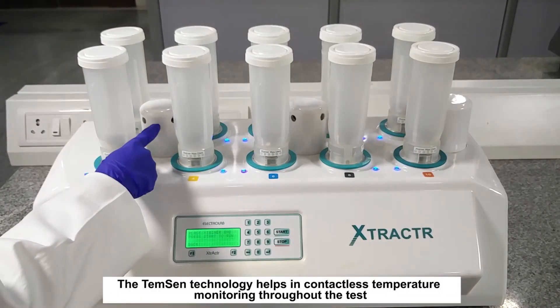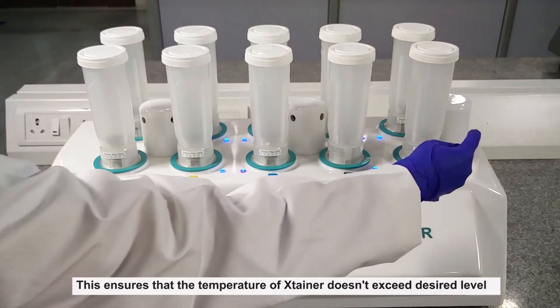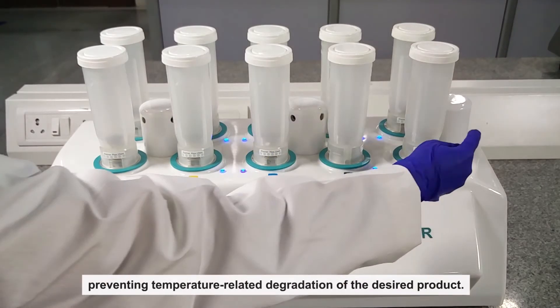The TEMSEN technology helps in contactless temperature monitoring throughout the test. This ensures that the temperature of the Extainer doesn't exceed the desired level, preventing temperature-related degradation of the product.